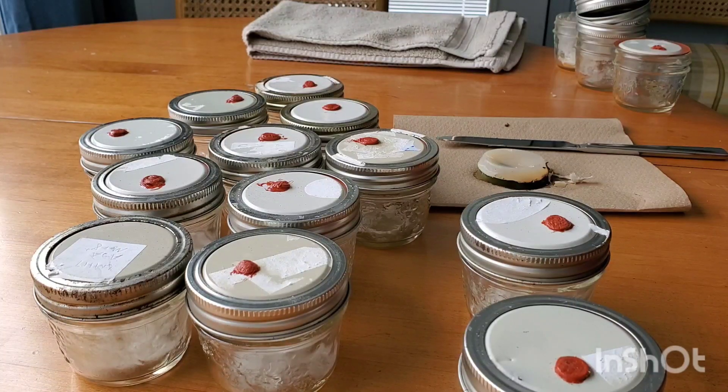Today I'm going to show you how to properly clean these used agar jars so they can be reused over and over again. It doesn't matter if they've been contaminated with mold, bacteria, or any other kind of contaminant — the pressure cooker will pretty much take care of that when we sterilize them with a new batch of agar.